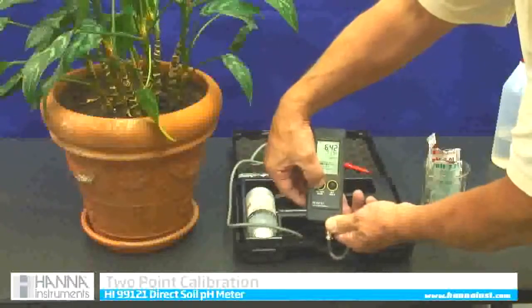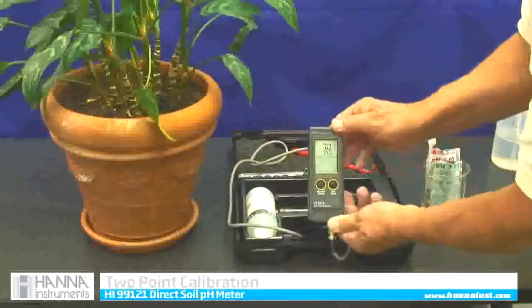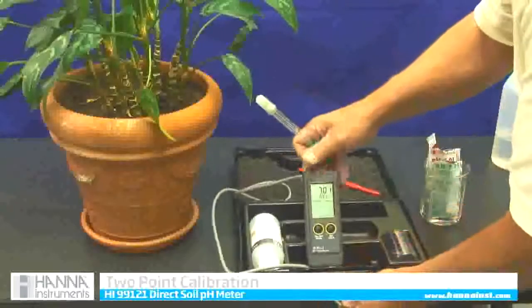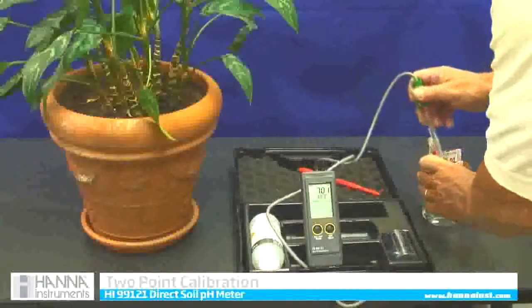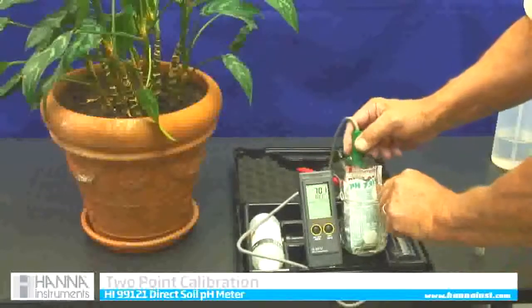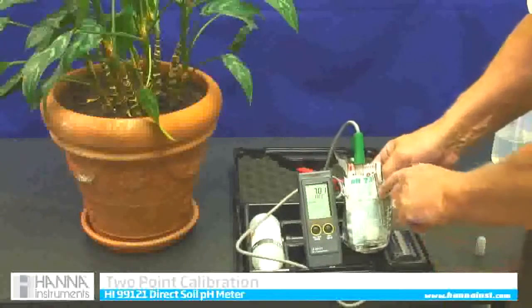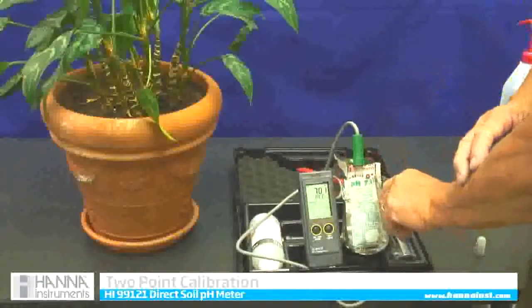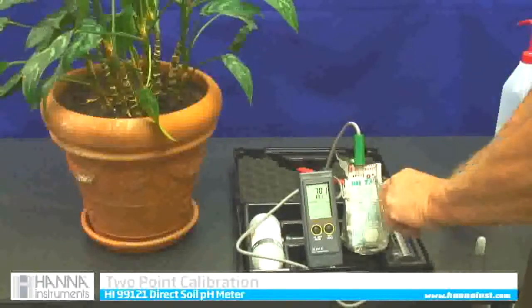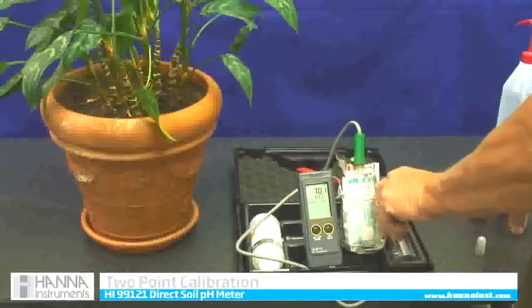I will go past off. It is now depressed and there's calibration. I am going to do what it tells me to do — it says use 7.01. So I am going to put my meter into 7.01 solution and swirl it around a little bit. The REC means it has recognized the 7.01. There is a flashing calibrated symbol on the lower right-hand corner of the screen, meaning it is actually calibrating itself to this standard.